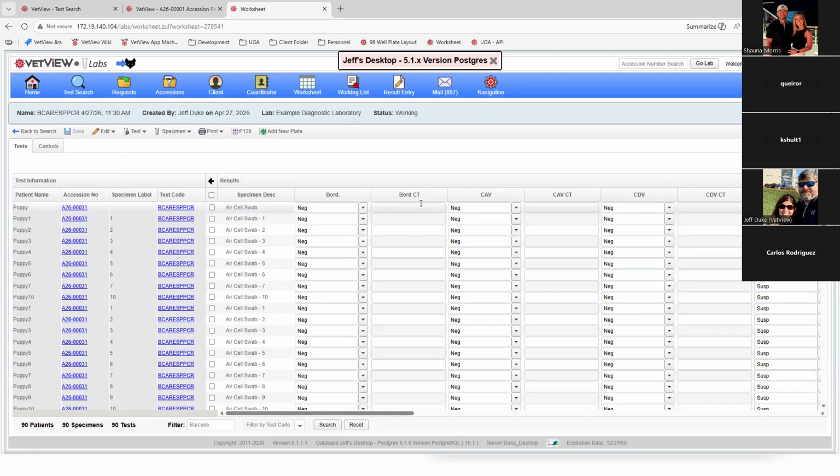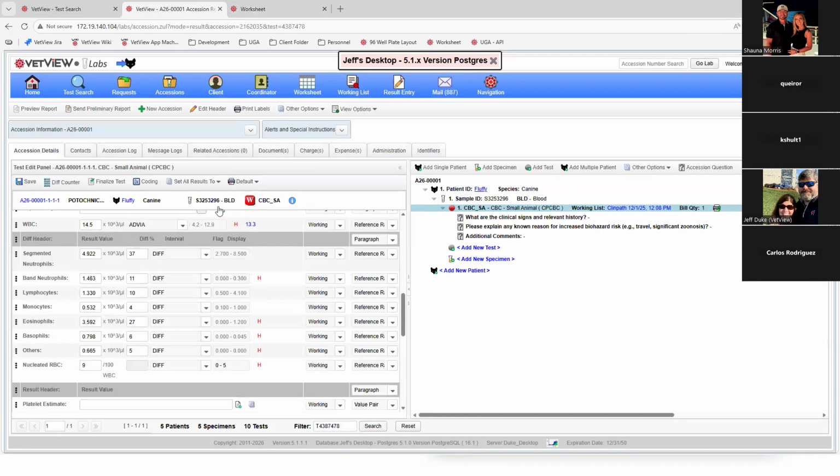Now the third kind of area, well, before I jump in, on the attachments, one area I forgot to mention is notes. When you're doing resulting out, there are times when you need to add comments or attach things as notes, or make notes of what a client might say, things like that.